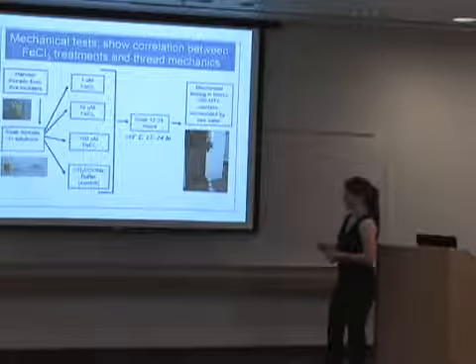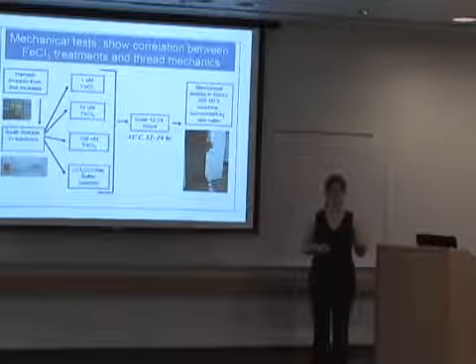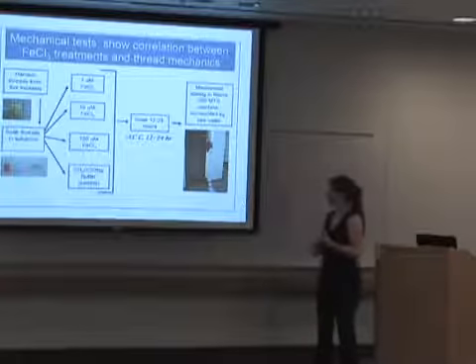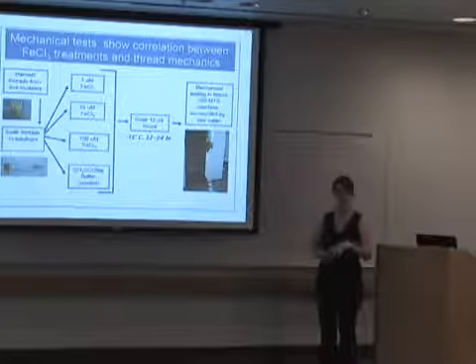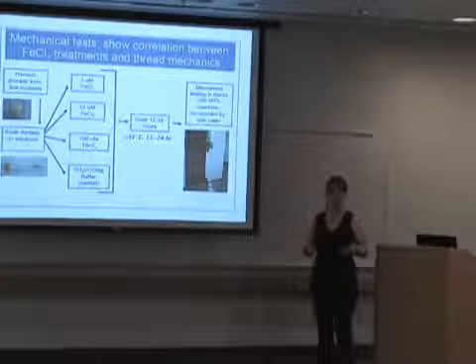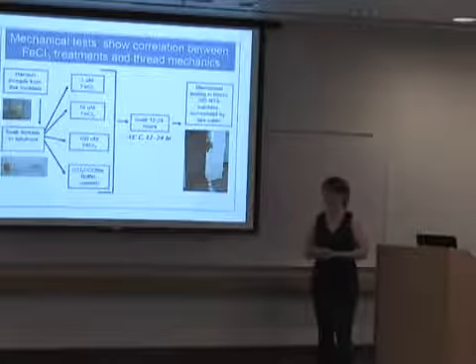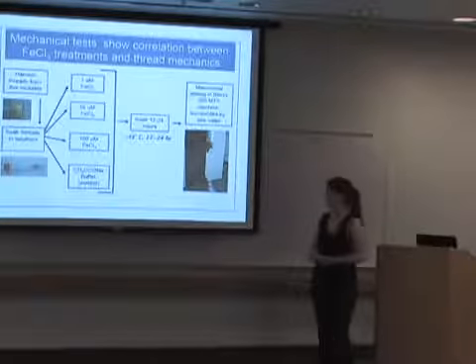I harvested threads from live mussels, and then I soaked them in solutions of varying iron trichloride concentration, specifically 1, 10, and 100 micromolar iron trichloride. I made these solutions using a buffer that was set to be at a pH between 5 and 5.2, and the reason I did that is because I wanted the iron to be in a proper form so that it could be absorbed by these threads and form the crosslinks with the DOPA. So I was wanting it to be in the Fe3+ form, which happens at that particular pH.